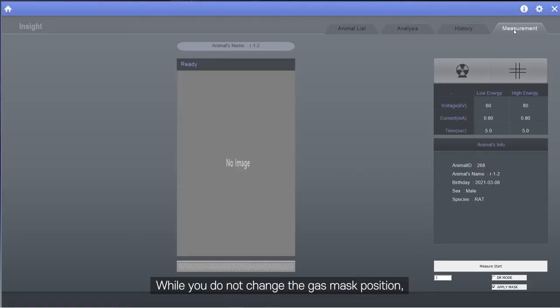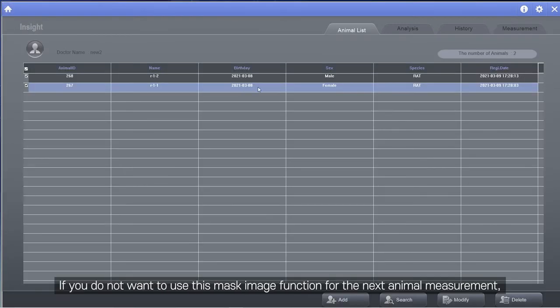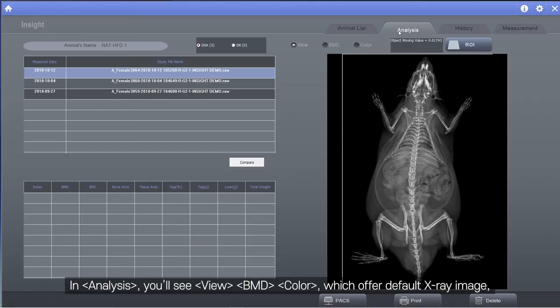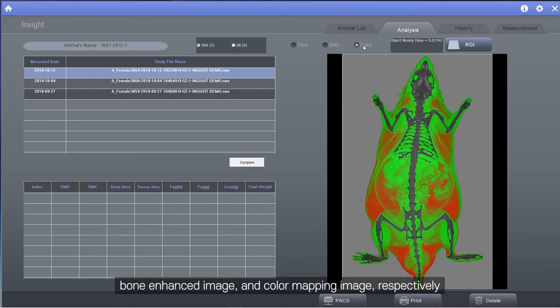While you do not change the gas mask position, the last updated mask image can still be used by clicking Apply. If you do not want to use this mask image function for the next animal measurement, uncheck Apply Mask in the measurement window. In Analysis, you'll see View, BMD, Color, which offer default X-ray image, bone enhanced image, and color mapping image, respectively.